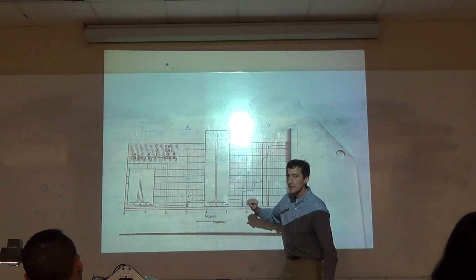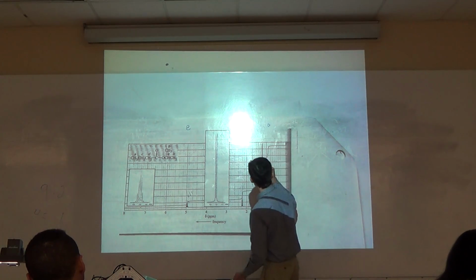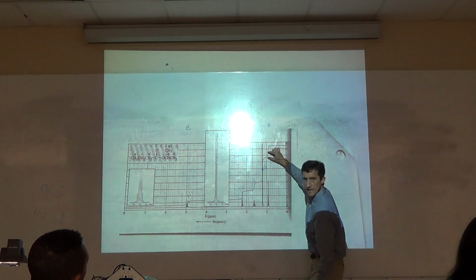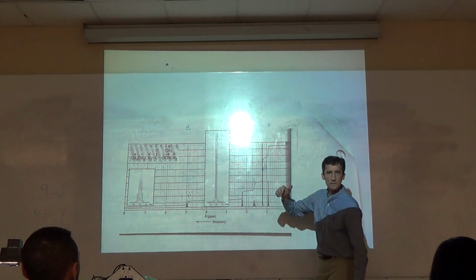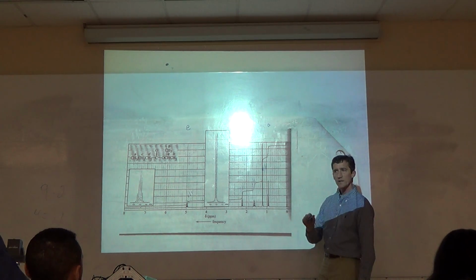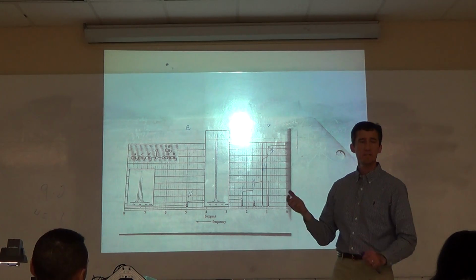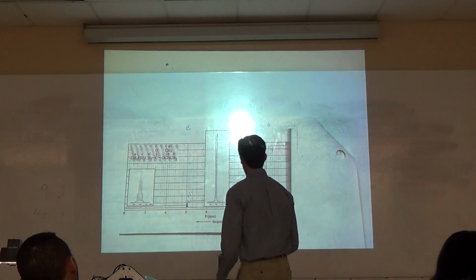Knowing structure, we can take a good guess that it's 6. It looks like it's 3 of those, so it's 6. So if that's 2H, how many is this last one? It looks like it's not double for 4, but it looks like it's 1.5 of my finger gaps. So what's 1.5 of 2? 2 times 1.5. 3H. I could have done it with a ruler, instead I used my finger gap, because it's pretty big here.